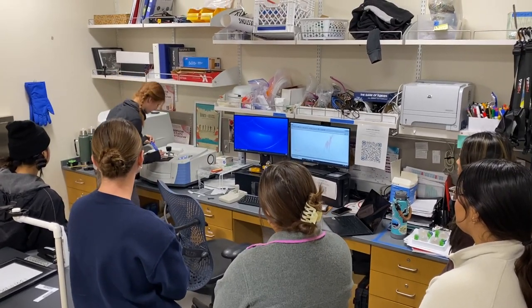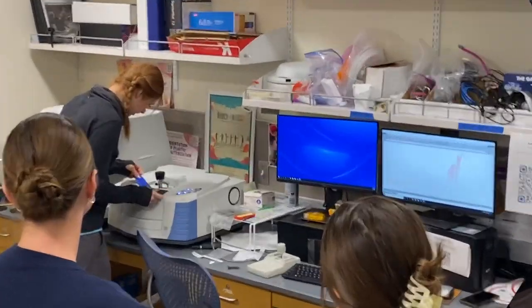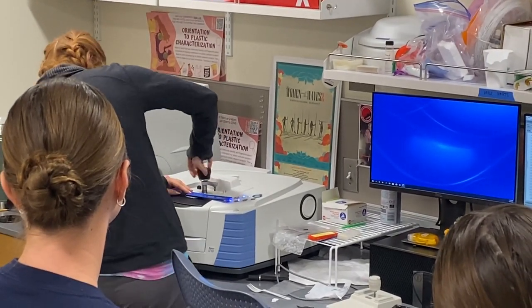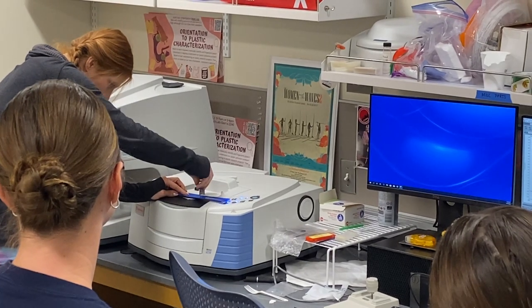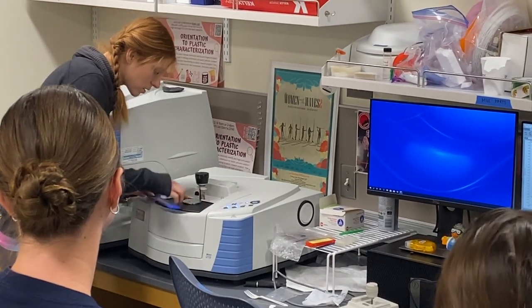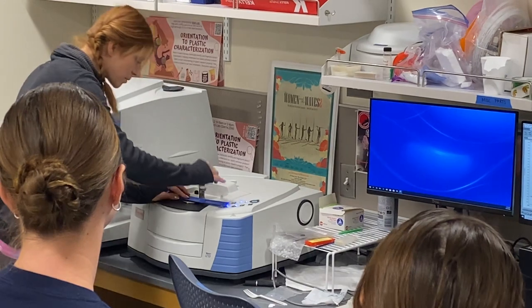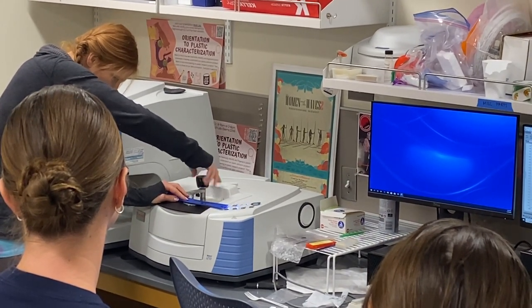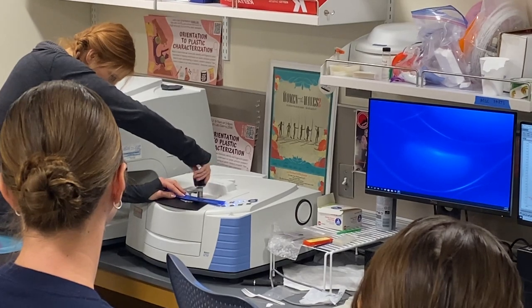All right, so that's what's fun about this — I can just kind of pop this in here. It's bendy, but it'll be fine. I'm going to bring this over here. Right in the center of here is a little diamond, so we're going to center that right over that, and then I'm going to squeeze it down gently.